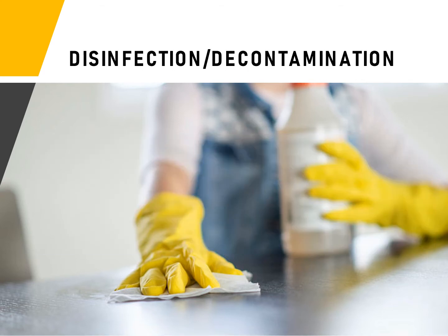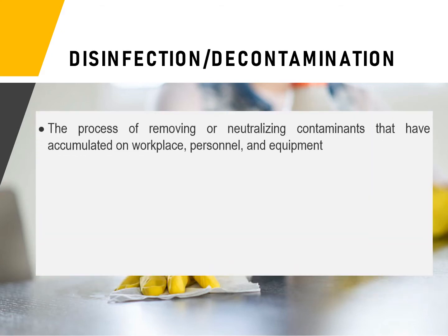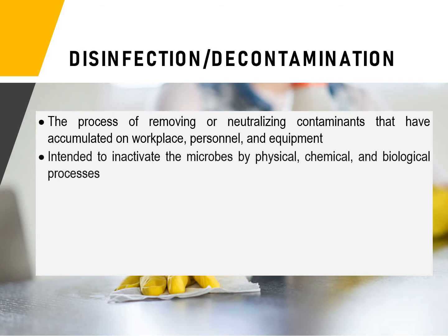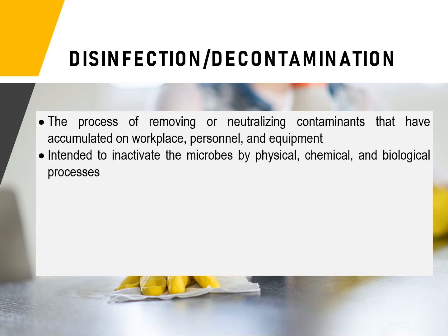Now, what is disinfection or decontamination? This is the process of removing or neutralizing contaminants that have accumulated in the workplace, personnel, and equipment. It is intended to inactivate the microbes by physical, chemical, and biological processes, or a combination of these methods.